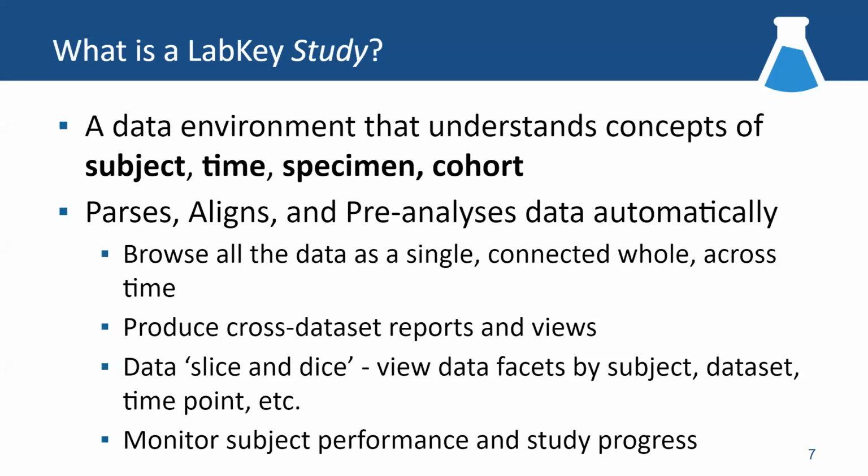Anytime you put data into the study module, LabKey is going to look for those concepts. It's going to look for the data that corresponds to those concepts, and it's going to parse it, it's going to align it, and it's going to pre-analyze it. And that's going to make your final analyses a lot easier.